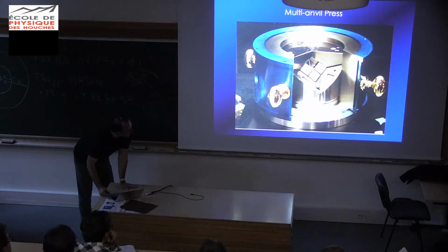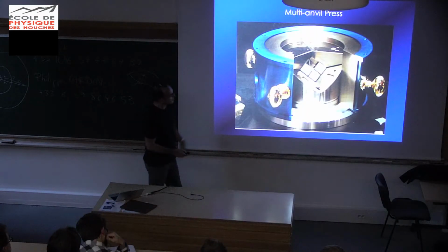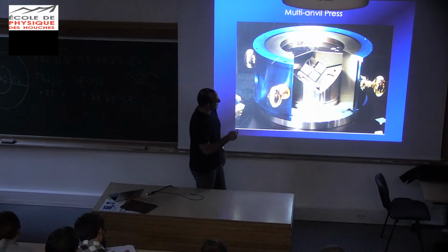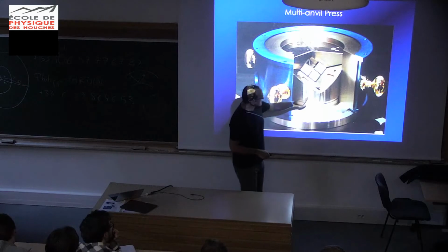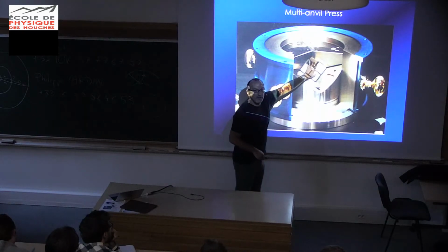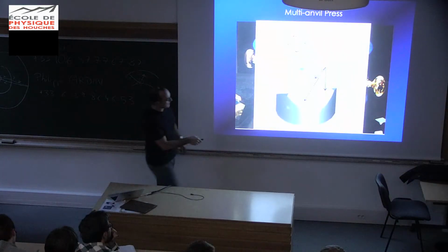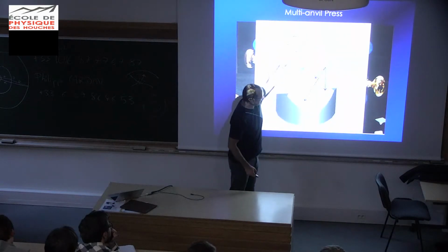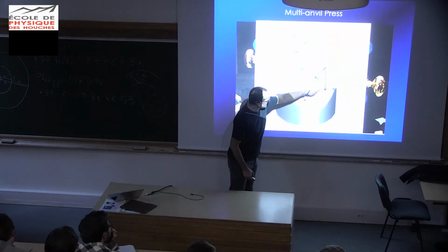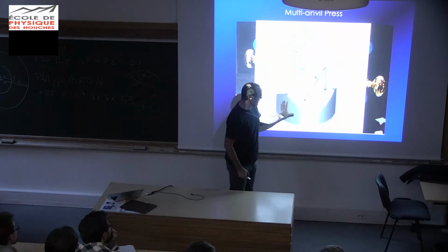So how do you transform the uniaxial pressure to a multi-axial pressure? You use this funky device called a Walker hat box. It contains 6 primary anvils and your assembly here with the 8 secondary anvils. The primary anvils look like that. So they're flat on the bottom, they would be flat on the top, and they're cut this way. So that's 1, that's 2, that's 3.